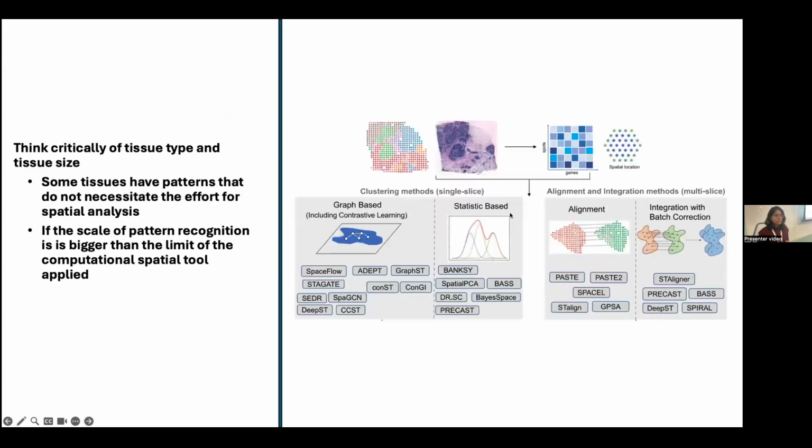So these are all the spatial clustering methods that you will come across. In fact, segmentation is the same thing. For all kinds of segmentation, and we're not doing segmentation for this workshop, we did it for the Xenium, so you can go and look at the ISO 2024 workshop. We're not going to do it here, but it's the same principle: how you define boundaries and how you define domains. Domains are also kind of boundaries.